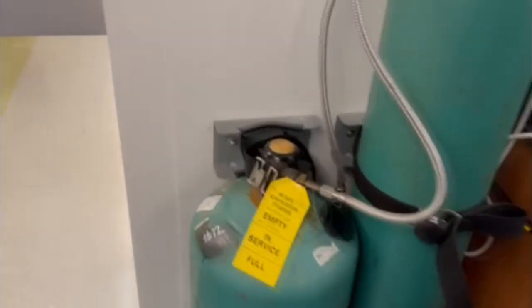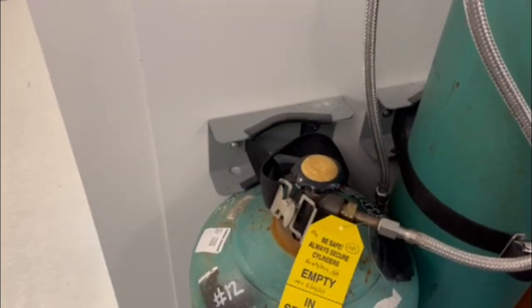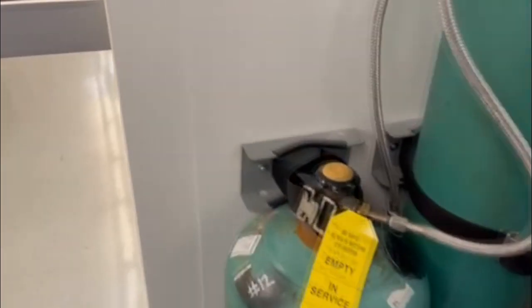Welcome to another University of Scranton Chemistry Lab tutorial, this time for the Atomic Absorption Instrument, or AA for short. Now the first step is not actually at the instrument itself, but rather at these gas canisters.